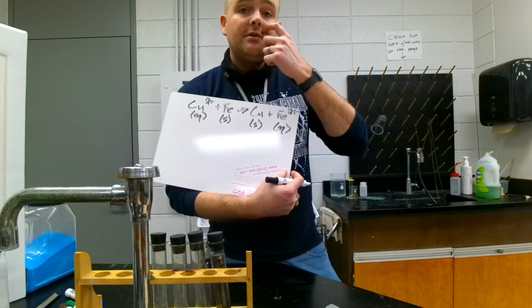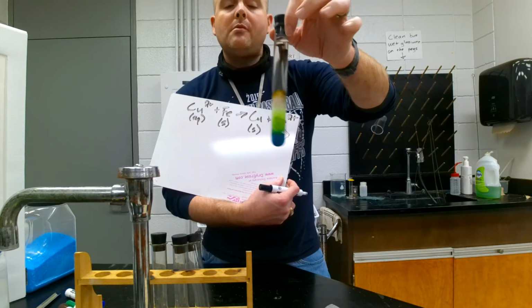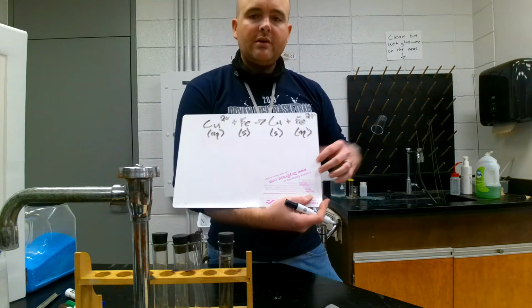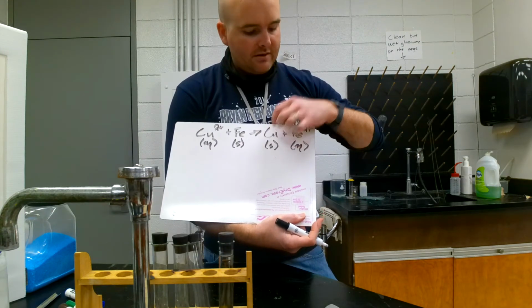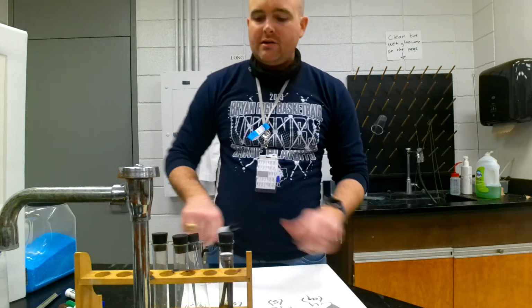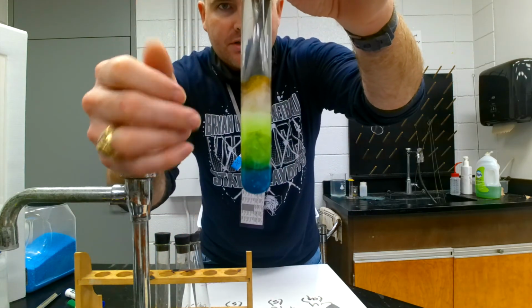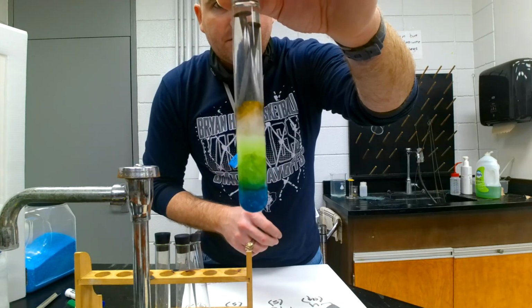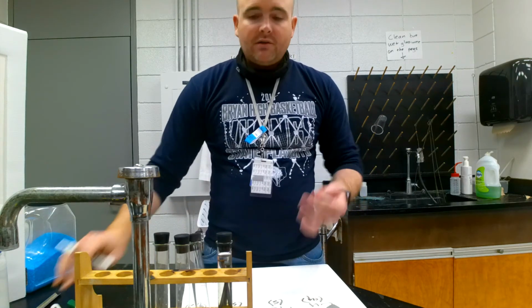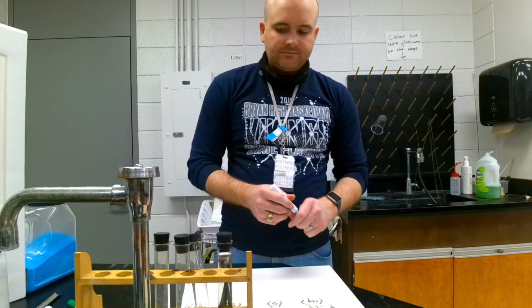Okay, if you did your reading, this is the same type of reaction as the rusting reaction. Okay, remember we added an electrolyte in there, and that's really helpful. So that's kind of what you should be able to see. You should have seen the copper solid. And now the iron 2 plus, this one is actually kind of a brownish orangish color. And so I believe some of that brownish orangish color that's dissolved in solution is partly due to that. And copper we know is also kind of brownish orangish as well. So both of those have similar colors.